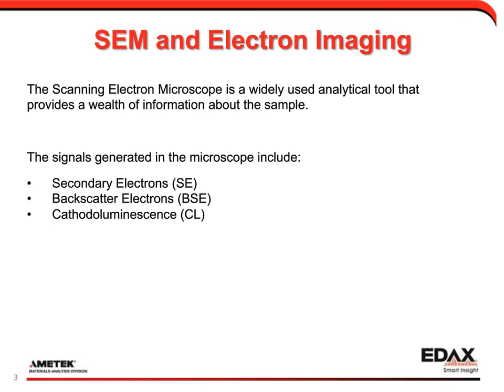What we are interested in is the X-rays coming out from the samples as we expose them to the electron beam. And given that EDAX sells EDS, WDS, and EBSD detectors, we should probably also mention diffracted electrons. If you have crystalline samples, you can get diffraction of the primary electrons coming into the sample that we can record, which will give you information about the crystallography, orientation, and different crystal parameters.